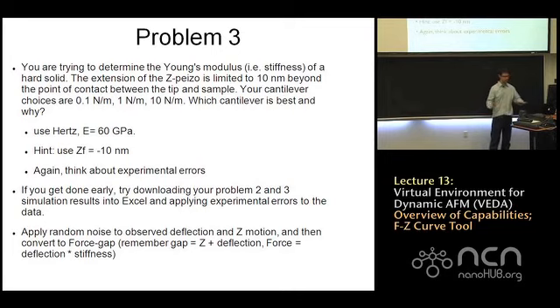The sample is a solid, so we're going to model this with a Hertz contact model instead of the linear contact. And the restriction is that the actuation of our Z piezo is somewhat limited. In the experiment, you can't specify any range of Z; you're going to have limits to the actuation of the Z piezo. So let's assume that we approach the sample, locate the sample surface, and from here we can only traverse 10 nanometers from that point. So in your simulations, use Z final as minus 10 nanometers to represent the limitations of the Z piezo.